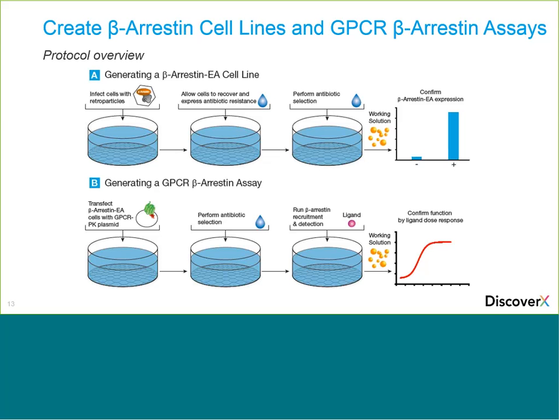I have a link here where you can download this PDF. It goes over the different family members and all the different applications used, from target identification all the way to preclinical studies. And then we went over multiple applications looking at mutants, orthologs, and tissue-specific differences as well.